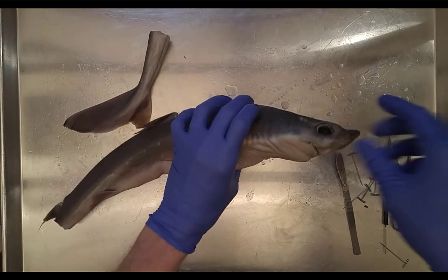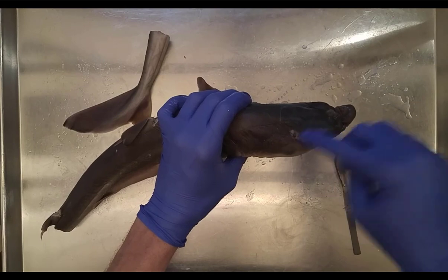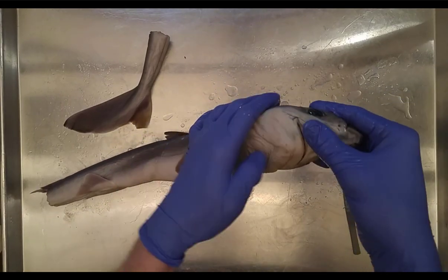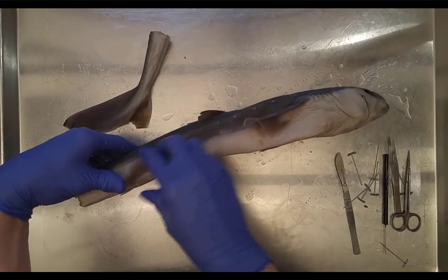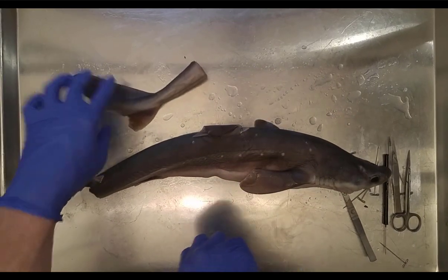To summarize the external features: rostrum, eyes, spiracle, ampullae of Lorenzini, nostrils, eyes, teeth, gills, pectoral fins, pelvic fins, anterior dorsal fin, posterior dorsal fin, and the caudal fin. Make sure you can identify all of these.